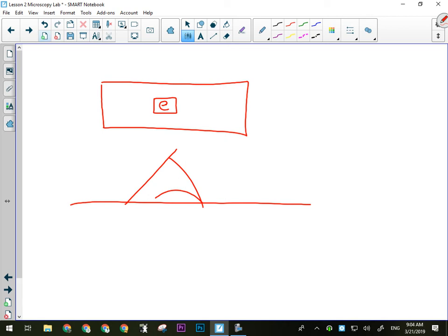It sticks for the same reason the letter E will stick. So when you, you can do this, you can turn it upside down, won't come off. Polar nature of water is awesome. We're going to have that and it'll just stick on there. Now you have your wet mount.